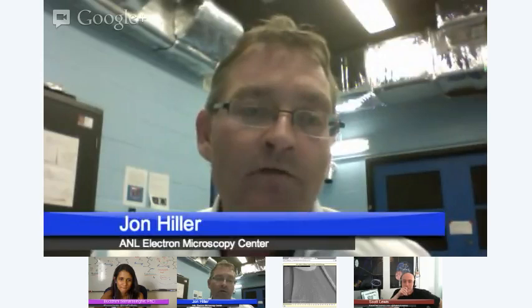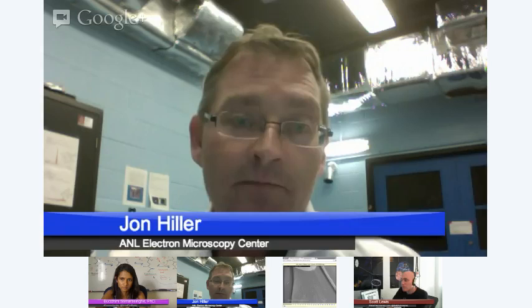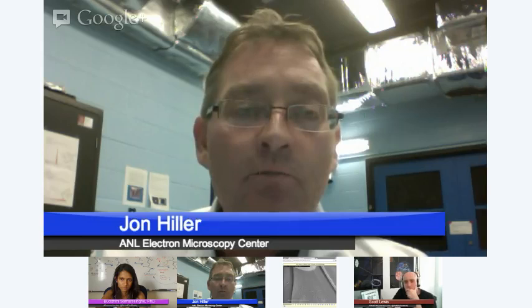And the other thing that we mentioned in the ad for the Hangout here is something that I did with three-dimensional reconstruction. Right. And that was done using one of these scanning microscopes as well as the ion beam attachment. So back when I was doing this, there was a big push for research of solid oxide fuel cells and the characterization of them. And the difficult thing was trying to figure out the tortuosity, or basically how much porosity you have compared to other things, because in a solid oxide fuel cell you need to have element A move through pores and react with element B. Okay. And if it doesn't have a way to get there, it doesn't work very well.